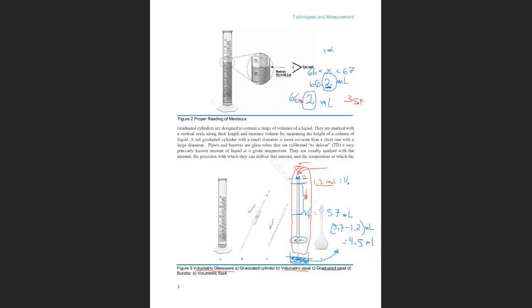The idea is that every measurement has an error, so you want to have the same error when you read the initial volume and then the final volume, and they cancel out. So it's not a good idea to align the liquid exactly at zero, but to read the initial volume and final volume, and then calculate the difference. This is how we are going to do the report when we get there, using the buret.